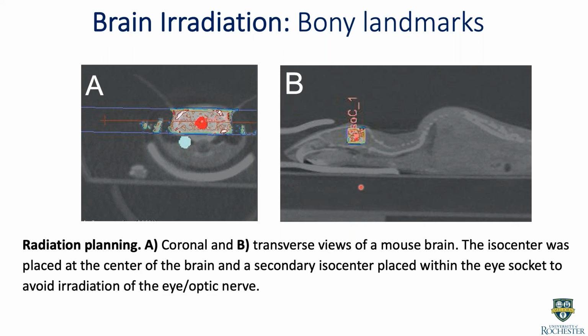This targeting approach, once it was developed, was used for a more complex series of experiments using a window chamber that was implanted into the mouse cranium. And I'll talk about that in the next slide, but really the purpose of that work was to examine the temporal radiation response of microglia in real time, in the same animal, over time, post-irradiation, using 2-photon microscopy. These experiments used transgenic mouse models in which neurons and microglia constitutively express fluorescent proteins for identification and tracking.